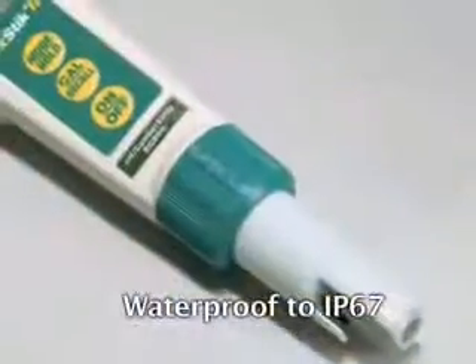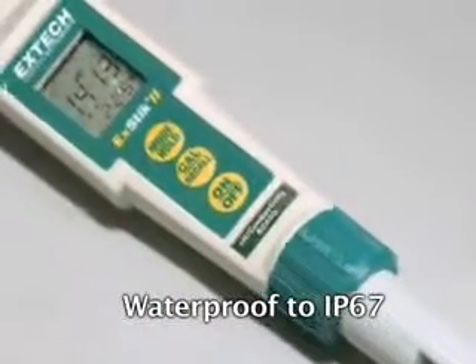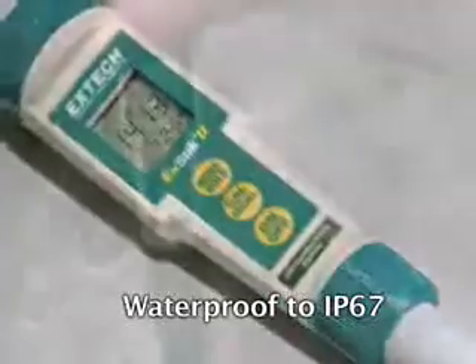The XTEC2 conductivity meters are waterproof, meeting the standards of IP67. This assures safe and accurate measurements even in extremely wet sampling conditions — and it floats.